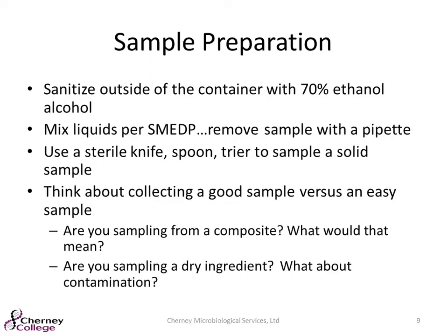So if you have, say, a wrapped block of cheese, you want to sanitize the outside of the container with ethanol alcohol. That way, when you cut into it or you open it, whatever is on the outside of that packaging does not go into the sample. For liquids, we follow the SMEDP, so Standard Methods for the Examination of Dairy Products. And you're going to shake those and remove the sample with a pipette. Make sure you use a knife, a spoon, triers, whatever that is.